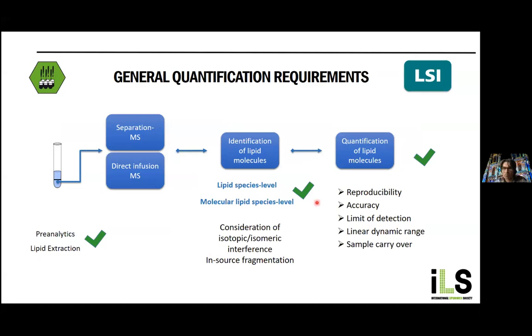And if you do assay development and quantification, you should evaluate reproducibility, accuracy of your assay, limit of detection, the dynamic range, and sample carryover.